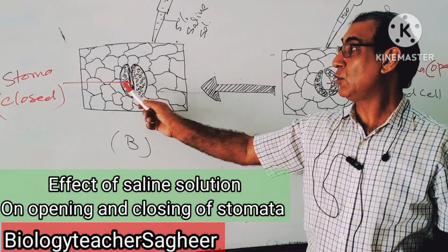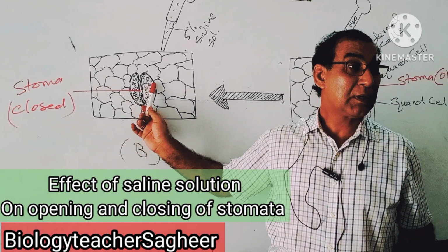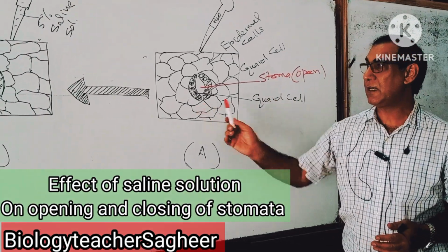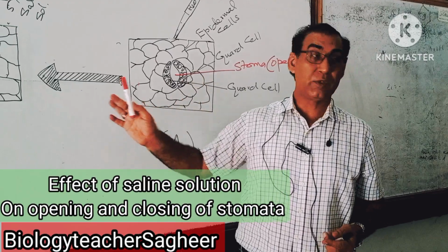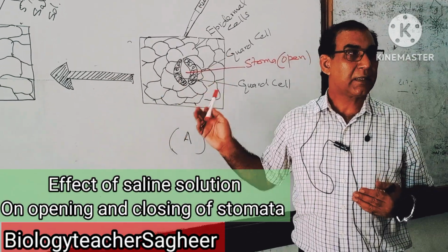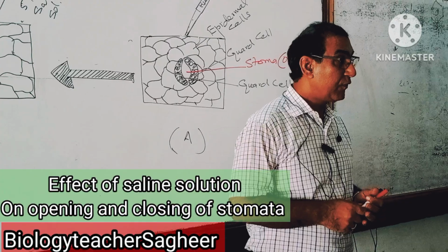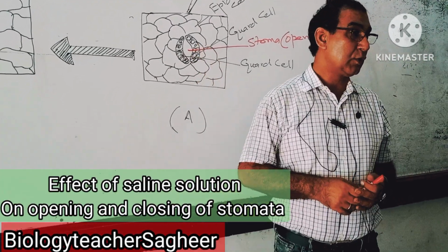The space is no more. The stoma becomes closed. So this is how you will study the opening and closing of stomata, the effect of saline solution concentration on the turgidity of cells, and subsequently the opening and closing of stomata.